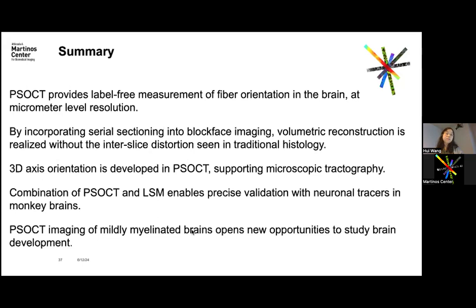Combination of PSOCT and light sheet microscopy enables precise validation of neuronal tracers in monkey brains. And lastly, PSOCT imaging of mildly myelinated brains opens new opportunities to study neurodevelopment.